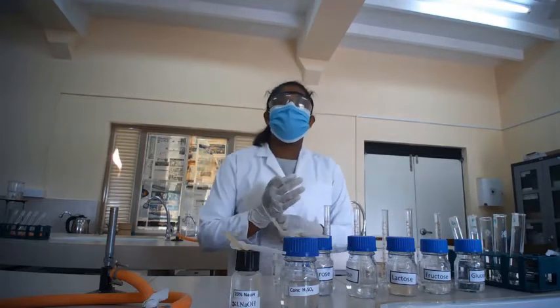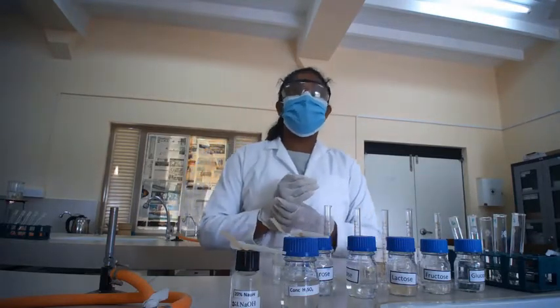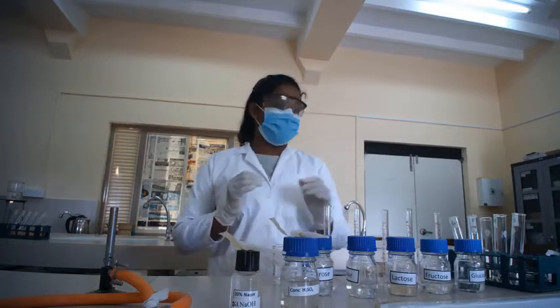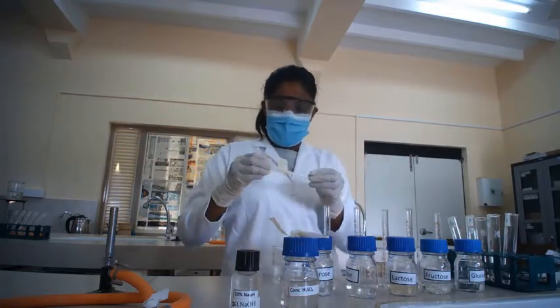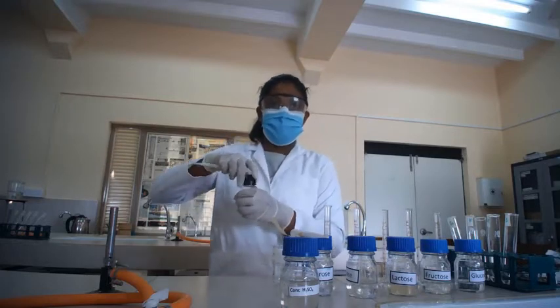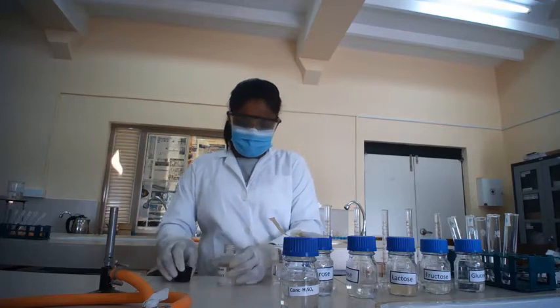Then as the next step, you are going to add 5 milliliters of 20% sodium hydroxide into all these solutions. Here we are going to use a dropper to add sodium hydroxide.